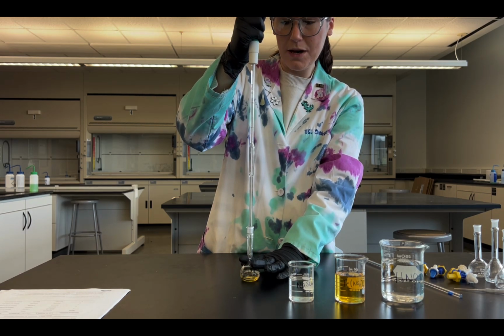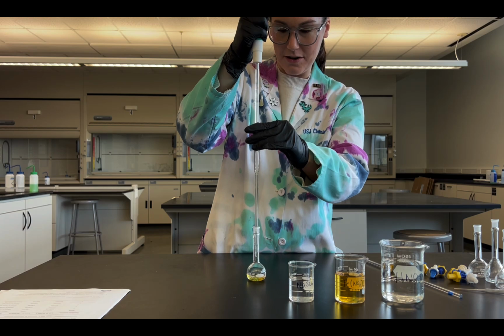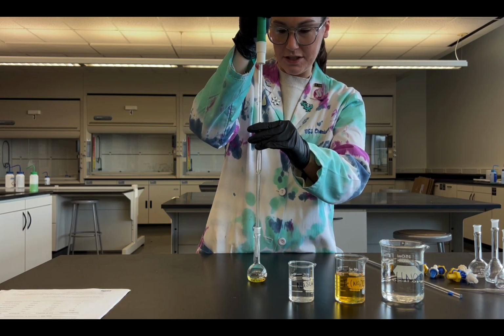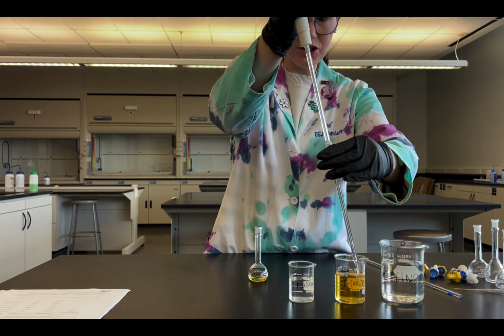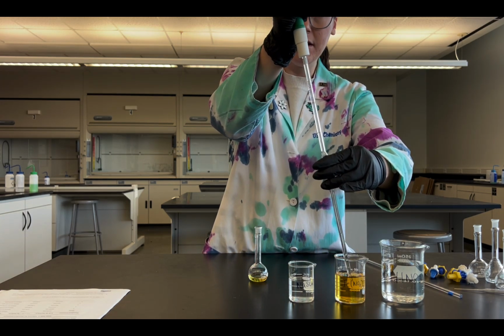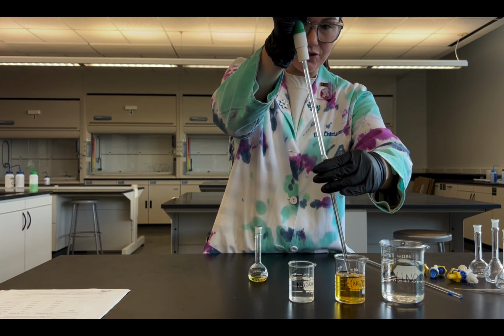Kind of hard to do by myself. Sometimes it's nice to have the partner do it. And then I'm just going to push this down to make sure I get all my liquid out. So that was 5 milliliters. And now I'm going to do another 5 so that I get 10 milliliters total.